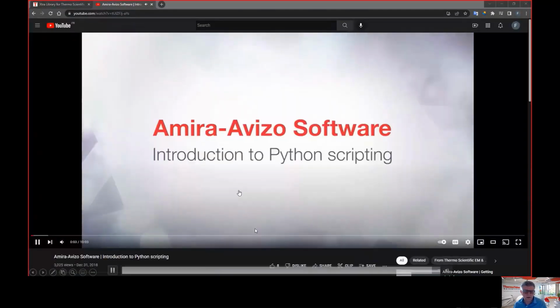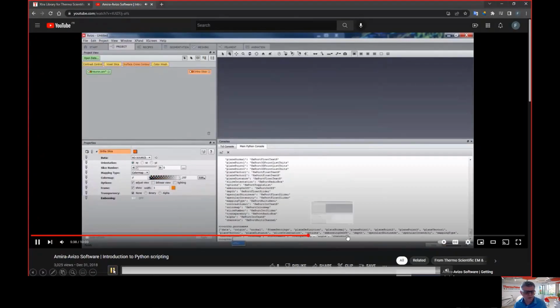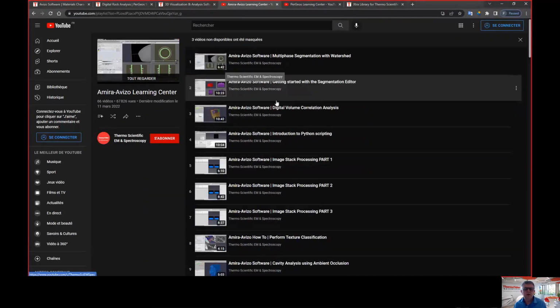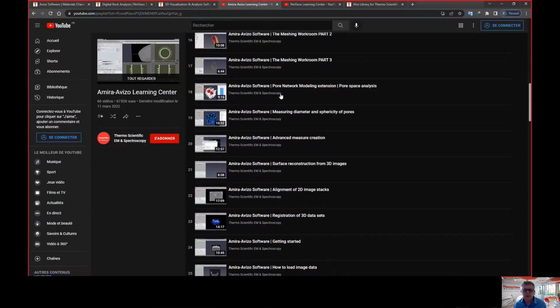It's done by Trevor, one of our product application engineers. So it's a little bit old. You see the interface, it's still older, but it shows you how to explore, how to do things. So you should look at this video. I think it's in the Learning Center of Avizo, and it's written Python in the text.